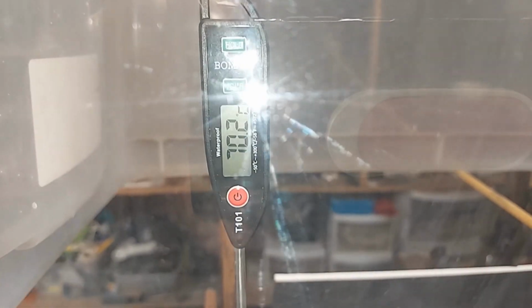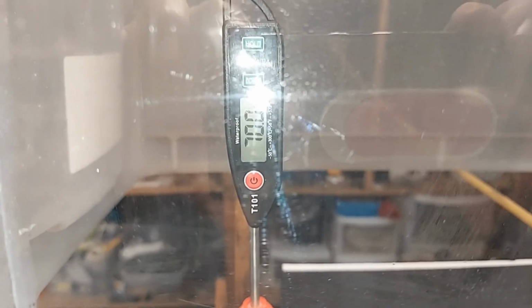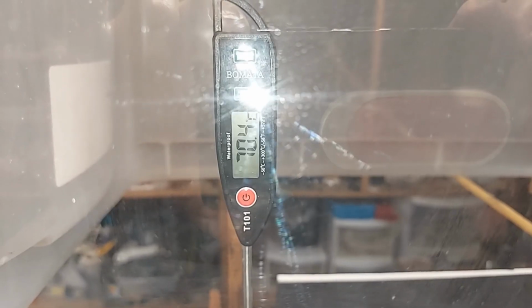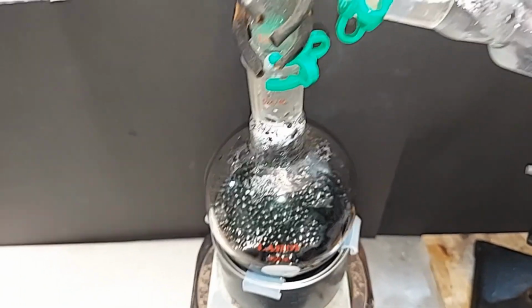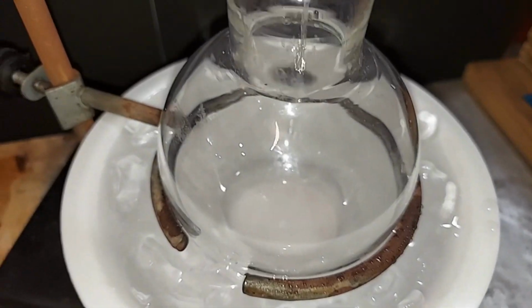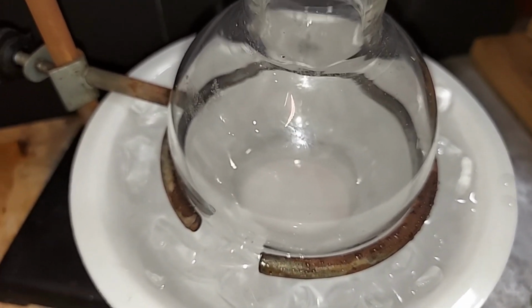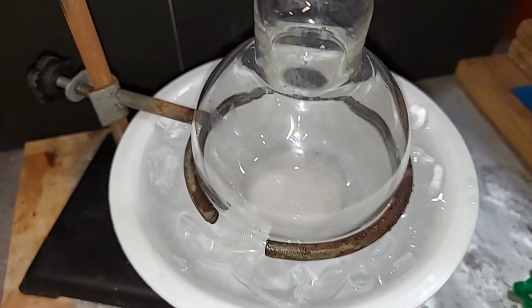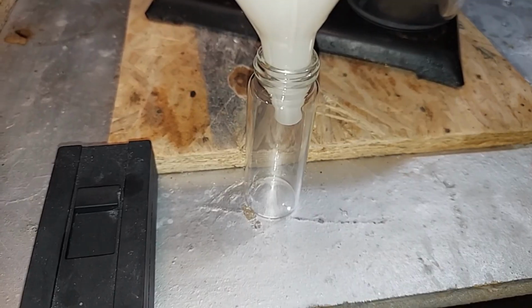I hadn't checked this in about 15 minutes, and we are rapidly losing temperature there. It was at around 97 and it's at 70, and it's dropping even though it's bouncing around like crazy. Down here, yeah, it stopped bubbling and boiling, so we're almost done, if not done. On this end, putting that stick up there actually slowed things down quite a bit. Oh, there's a little bit coming through, so maybe I'll let it run for another minute or two. But when it's done, I'm going to take this off quickly and pour the formaldehyde in there and cap it as fast as I can.